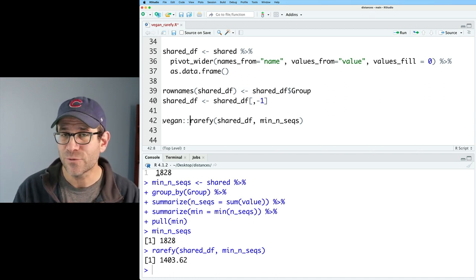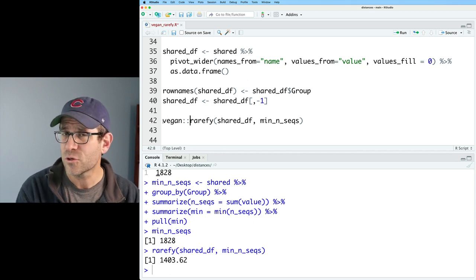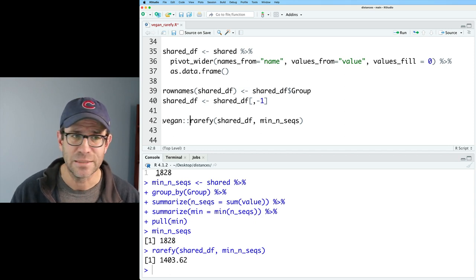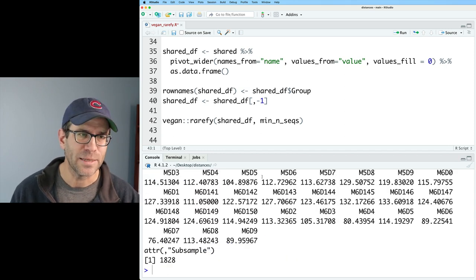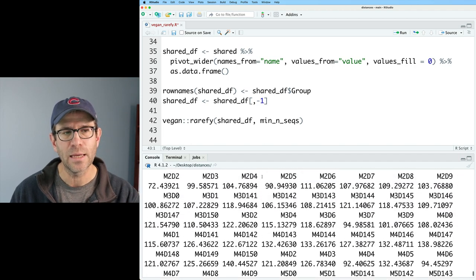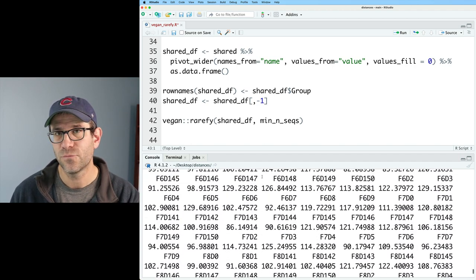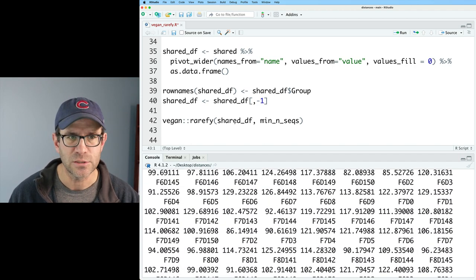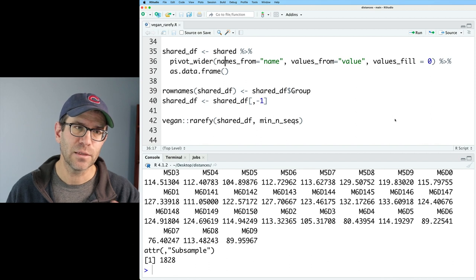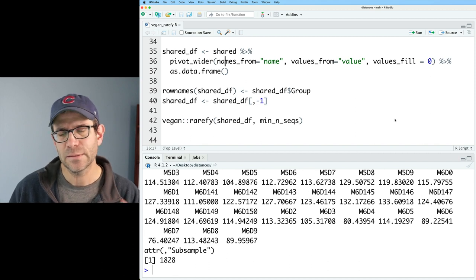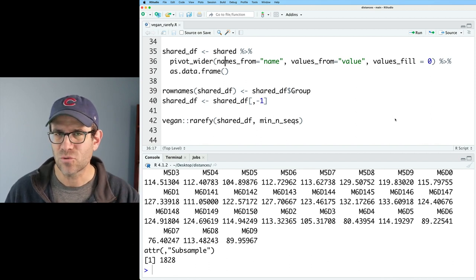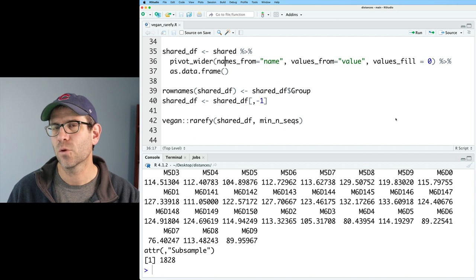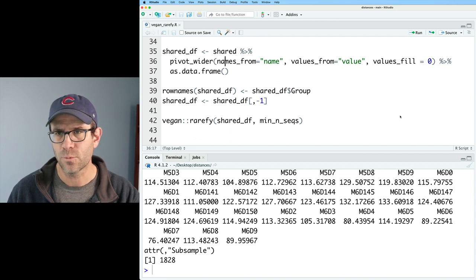So one way that we could check that would be to say vegan::rarefy. And what the vegan:: does is tells R, hey, I know there's multiple versions of rarefy out there, use the version from vegan, please. That gives us a quite a bit different output, right? Now we get different richness values for each of our samples. So I could keep doing vegan::rarefy.